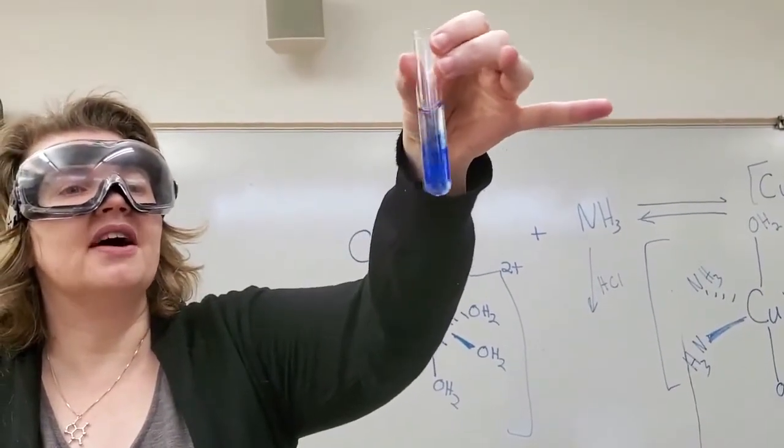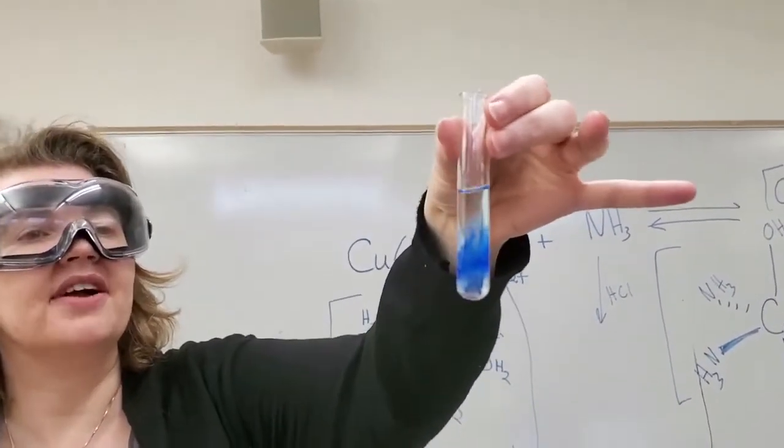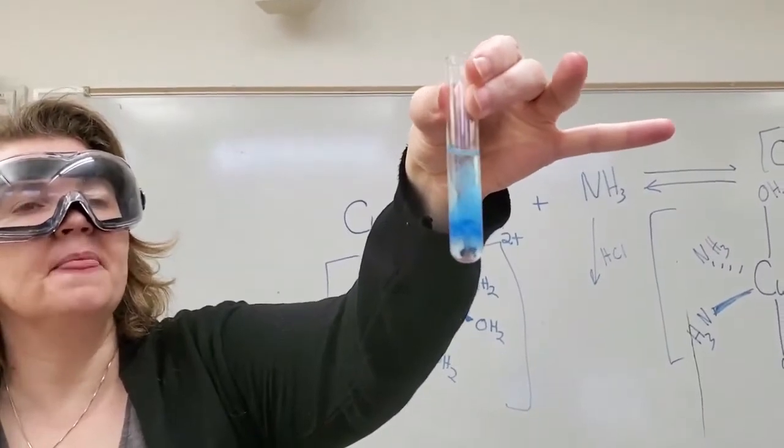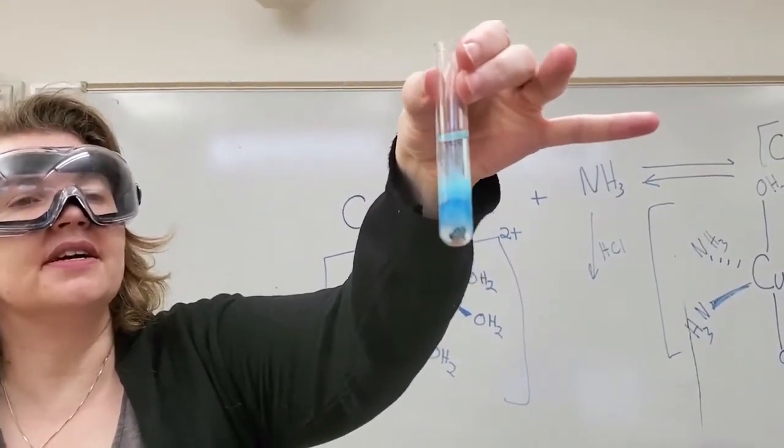Adding HCl. See it going backwards. Oh, I think I totally blew past the hydroxide. It's there just a little bit. Oh, there we go. There's the hydroxide.